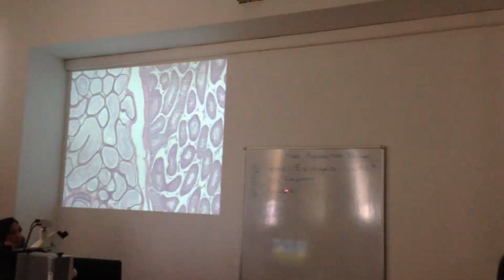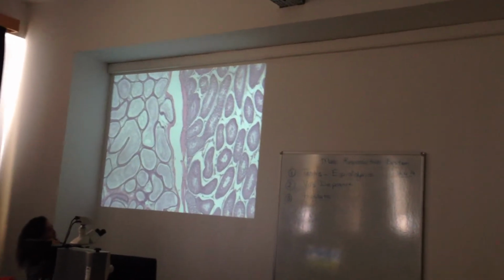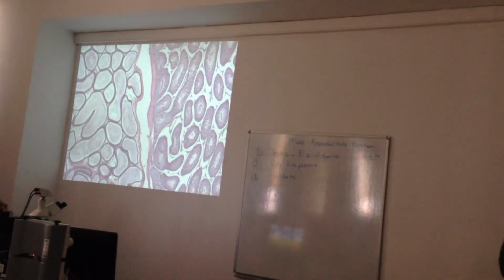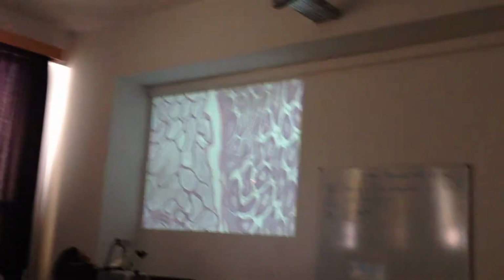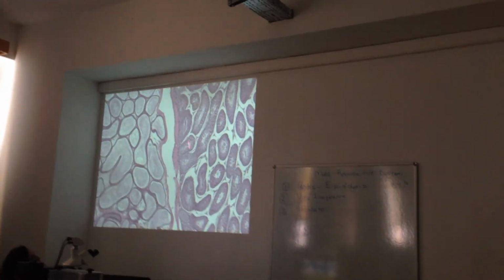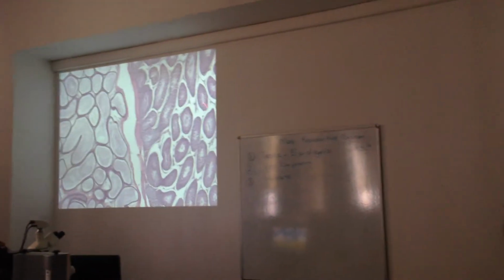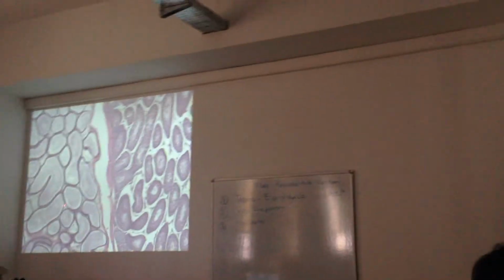Slide we will observe. Then we will look at vas deferens, and then we will observe prostate. Now on the screen you see the testis epididymis slide. In the lowest magnification, I can see both different tissues. At the right side you can see the testis. These are seminiferous tubules. And at the left I see the epididymis.